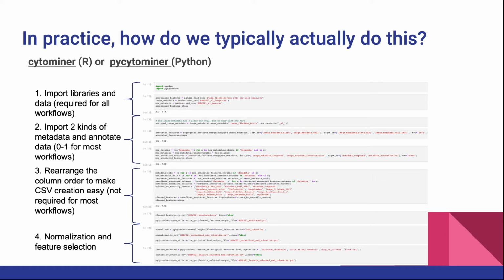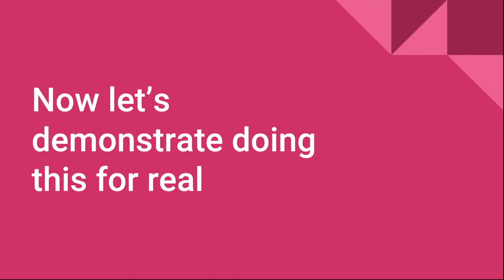And so even if you're not very comfortable using Python in a command line or in a notebook, the libraries that we've written can actually make it pretty easy for you to generate the highest quality data in order to actually do morphological profiling. So let's now take a look at how we actually, in practice, do discovery in Morpheus from one of these feature selected files.